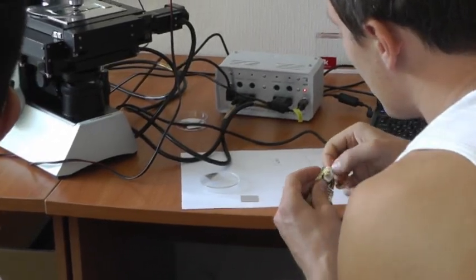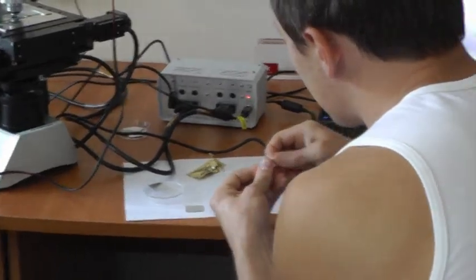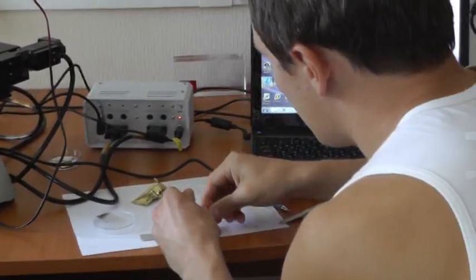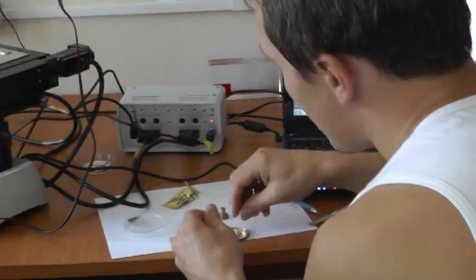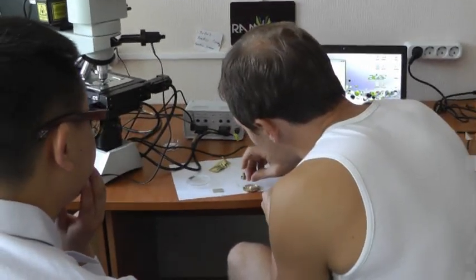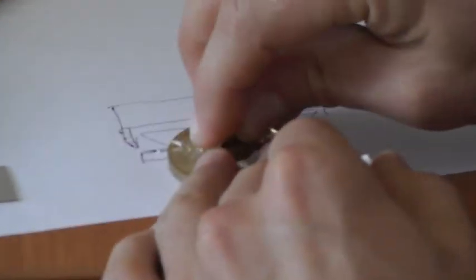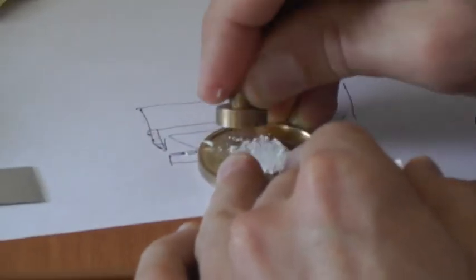We hope to see 3 components in the results of scanning, but before we start, I need to triturate some small piece of the tablet using this flat metal surface pounder.